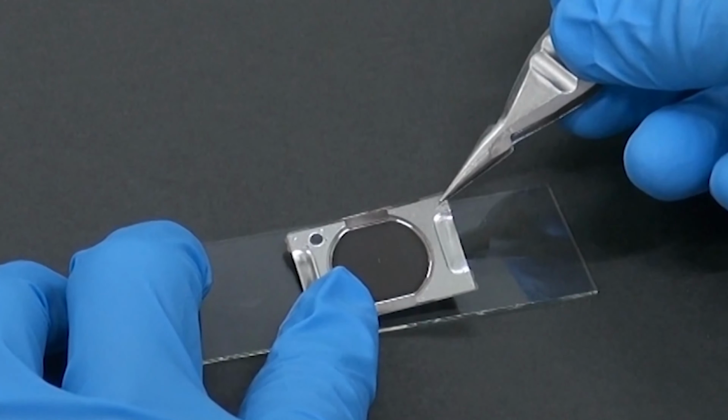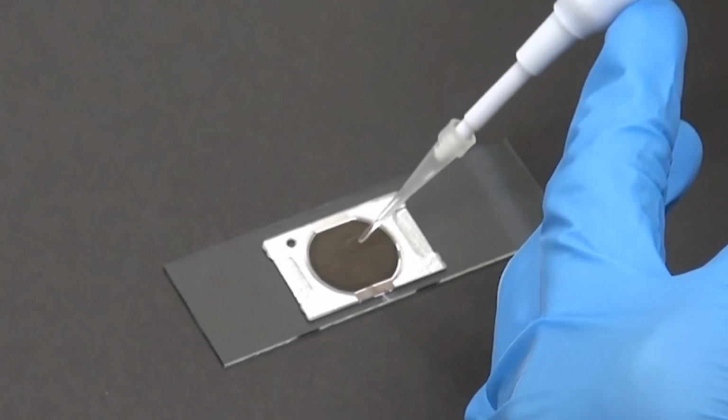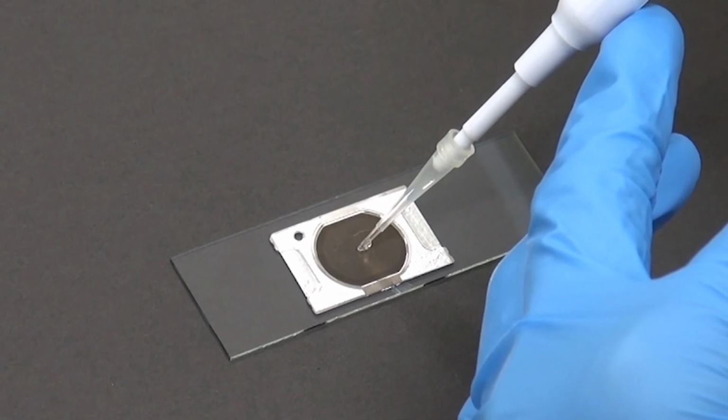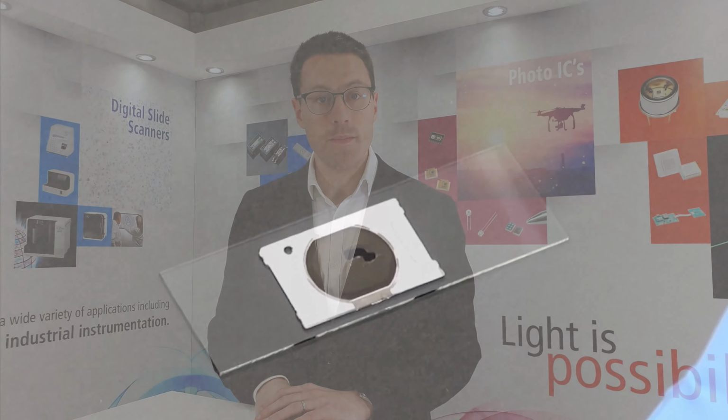For dry samples, you would slice this flat and thin, place the DUTHAME on top of this, and then apply a few droplets of solvent to the surface of the DUTHAME. Once this has dried, you can place into the MALDI.